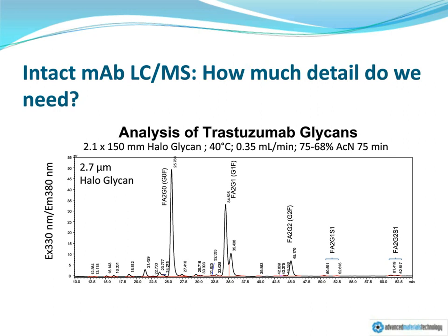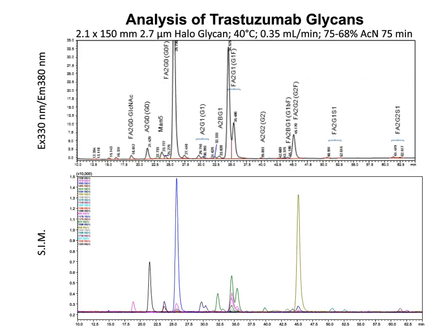What I'd like to point out is that now we're blowing up the data, looking a little bit closer to it, in any of these preparations, it's not just those 3 different masses of glycans, there's a number of less common variants at the glycosylation site. And we know what these are in this case because we've collected mass spectral data in series with the fluorescence data for these N-linked PNGase F-released glycans.